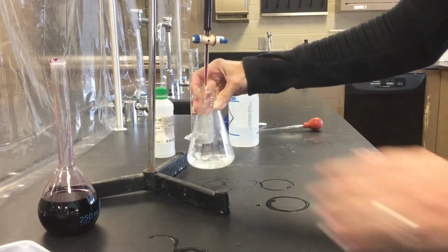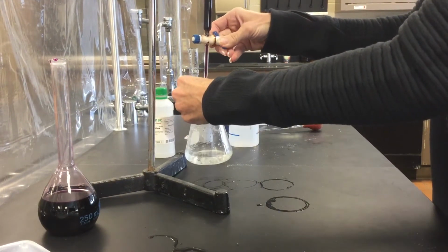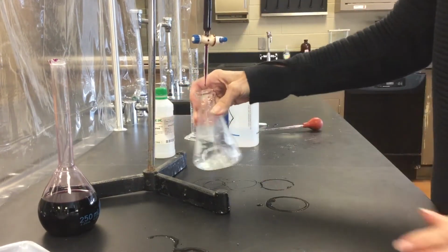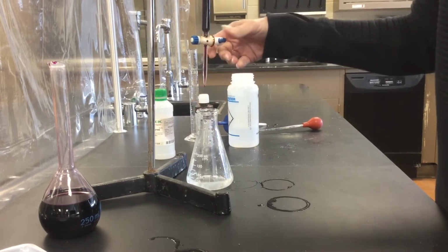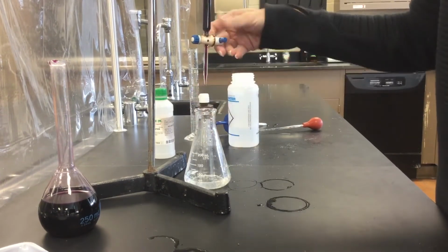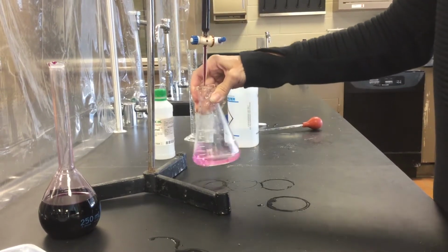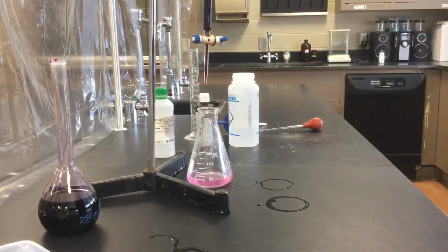Oh, let's see what one more drop does. Okay, well we'll stop with that. That's a good faint pink. I'm not sure why it kind of went back.